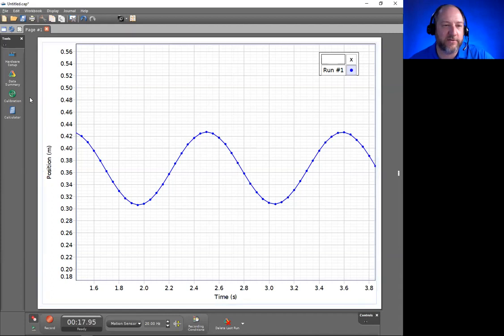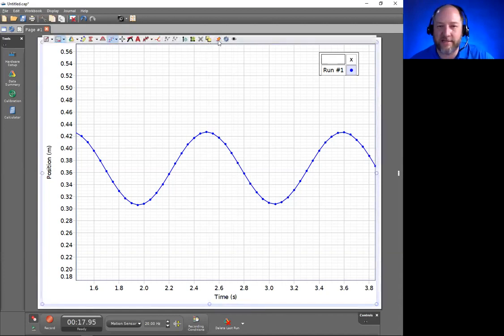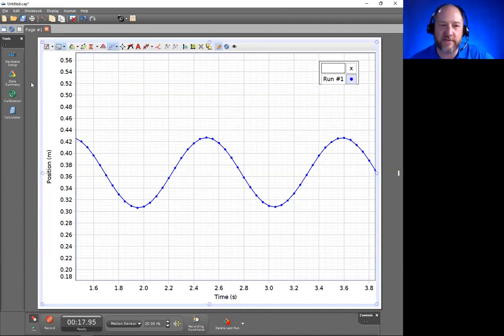Now, sometimes you'll see the graph toolbar, sometimes you won't, depending on where your mouse cursor is. It dynamically hides as you go away from it. We're going to focus on it though, so I'm going to pin it so it's always visible by clicking on this little orange pin, and that ensures it's visible no matter the position of my cursor.